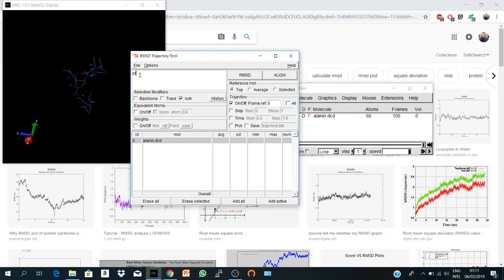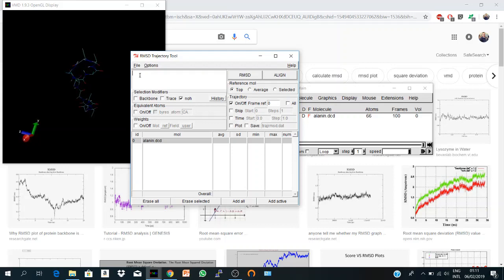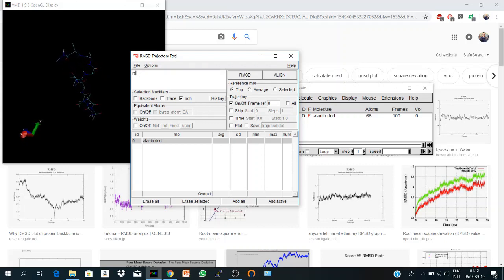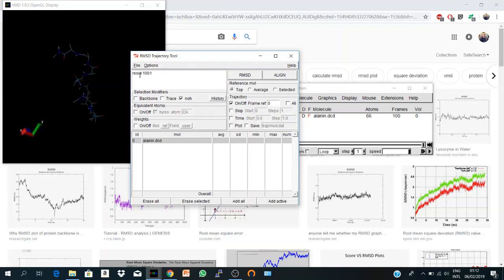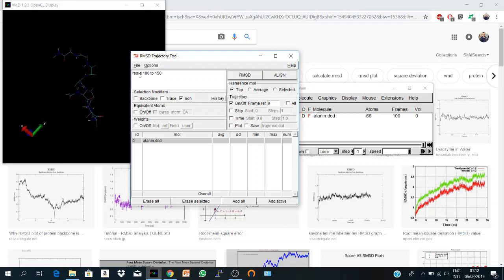You can say only protein, or you can say for example a specific region of your protein. I can say RESID 100 to say 150, so it will give you the RMSD of this region only.